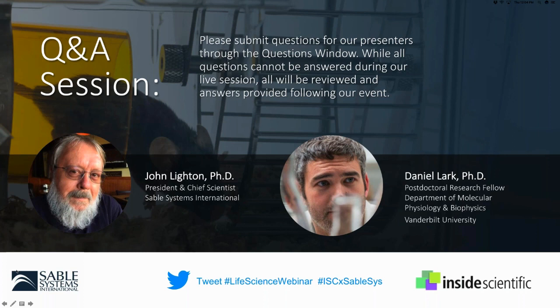Well, if the cage breaks, you have some problems, definitely. Now, obviously, the cage is not completely sealed. So if the seal is slightly broken in general, that's not going to have a very significant effect, because we are pulling from the bottom of the cage at a fairly high flow rate. But it depends, again, on the nature of the compromise. We have a lot of people who will take a mouse out of the cage briefly, inject it, and put it back into the cage. In our experience, that has minimal effects in terms of downstream disruptions of metabolic information. Obviously, there's a short-term one, but within 3 or 4 minutes, you're back to pretty much where you were before.